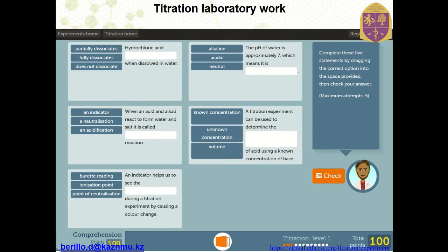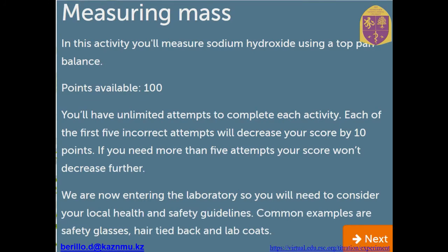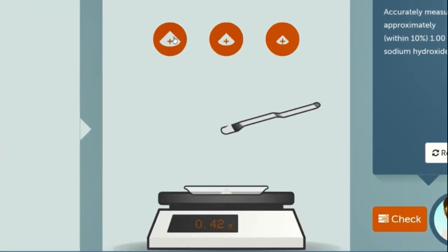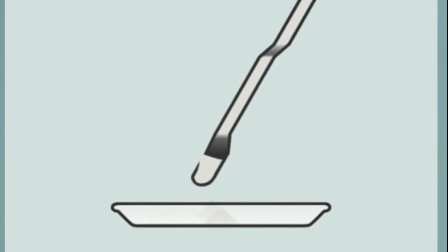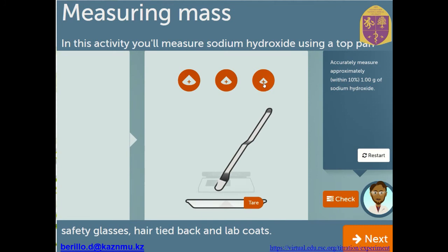Another very interesting laboratory work is titration, which is very useful in pharmacy for quantitative evaluation of substances. This platform allows you to train your skills in acid-base titration and also oxidation titration using potassium permanganate. You need to select the correct answers, and then a short quiz must be performed before you start the experimental part. The experiment involves measuring the mass of sodium hydroxide, and it is useful that the simulation highlights safety — that glasses and hair are tied back and you should wear lab coats.